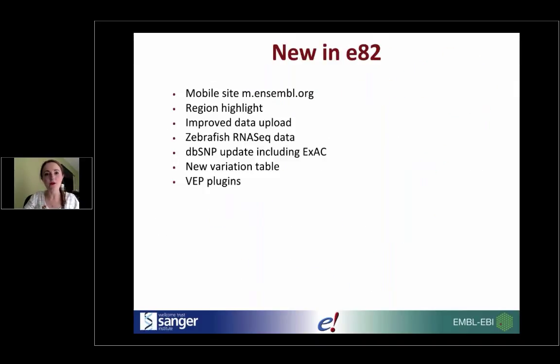So let's talk about what's new in Ensembl 82. One of the exciting things, and I'll go through all of these things in a bit more detail, is we have a new mobile site. So m.ensembl.org is where you can find our new mobile website. It's a bit stripped down. We'll see a bit about what's in it in a moment, but do have a look and a play with that.